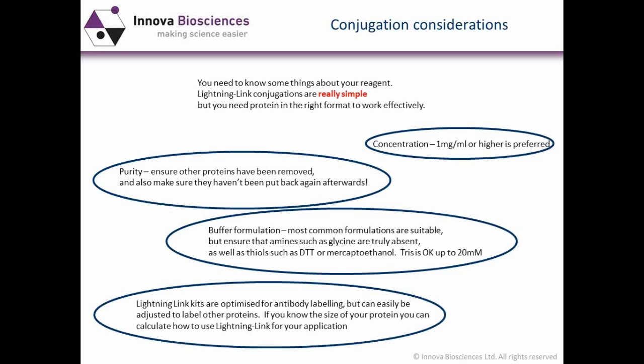It's important that your antibody is as pure as possible, so ensure that it's been purified, and also make sure that stabilizing proteins such as BSA haven't been added back into your antibody preparation, as they will interfere with the reaction.